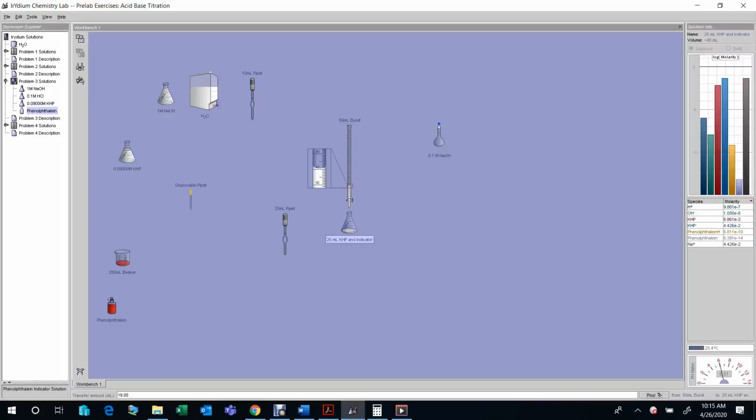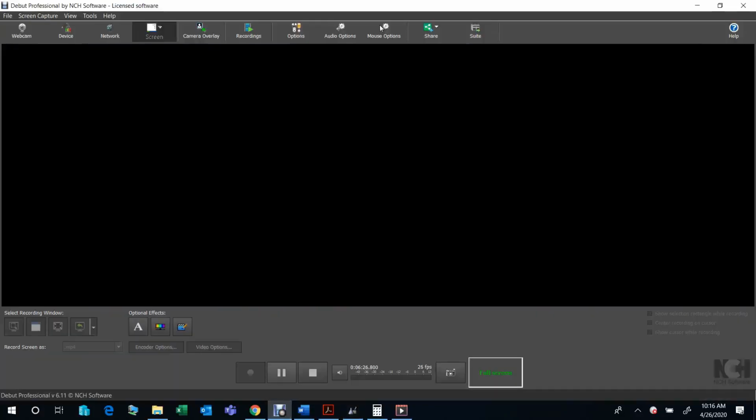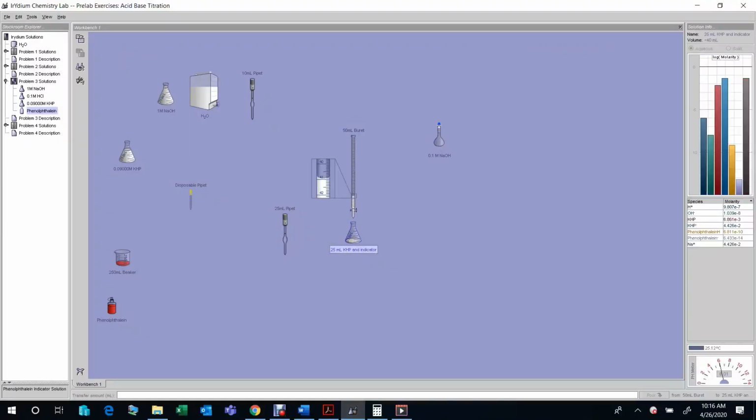We pour. You see, the color does not change. And now we can start to do the titration slower, and then we can add 0.2, or we can be more cautious. We can add 0.05, and we can just keep pouring.